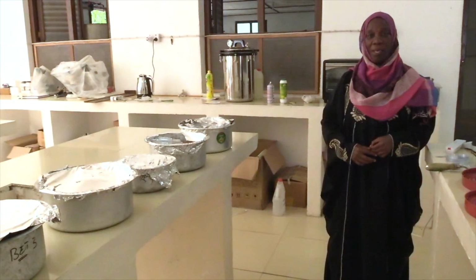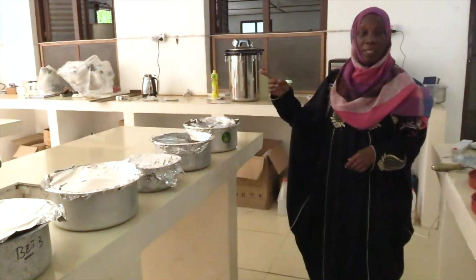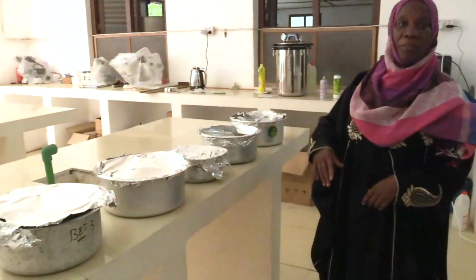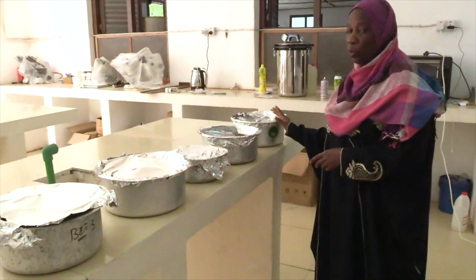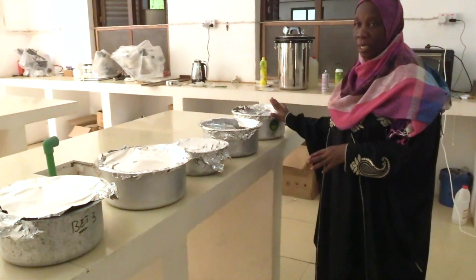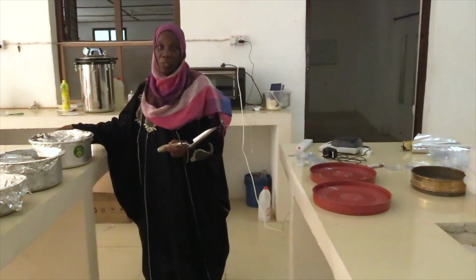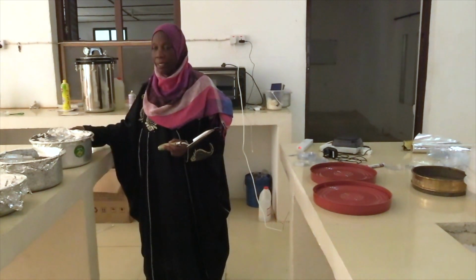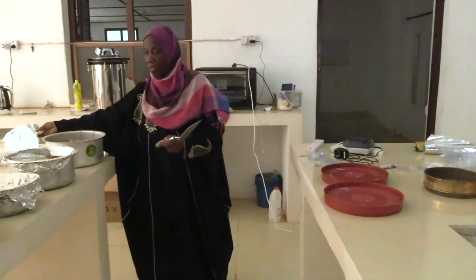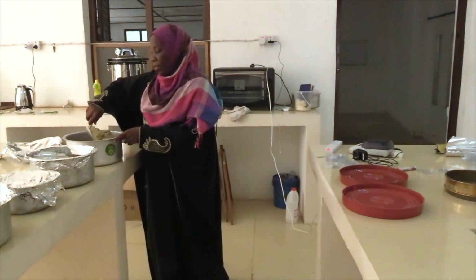So after fieldwork, now we have the 5 replicates already collected in the field, from transect 1, 2 up to 5. And now we want to determine the moisture content of each replicate. Before we take the amount of sample from each replicate, we homogenize the replicate.